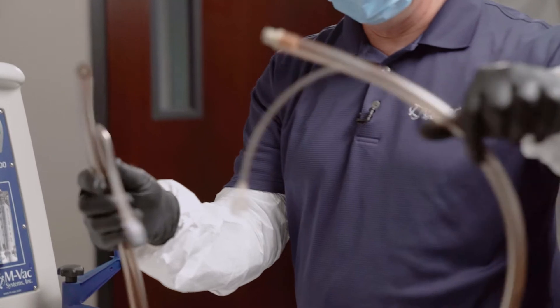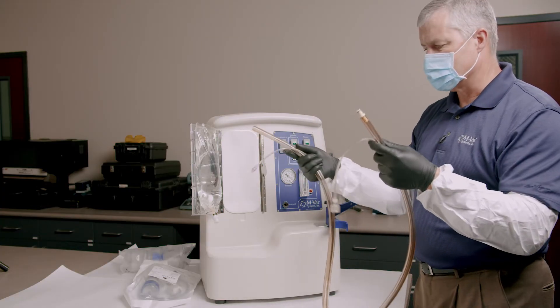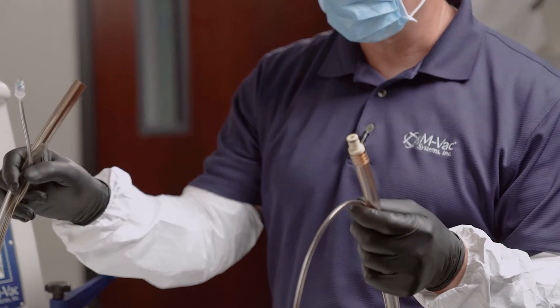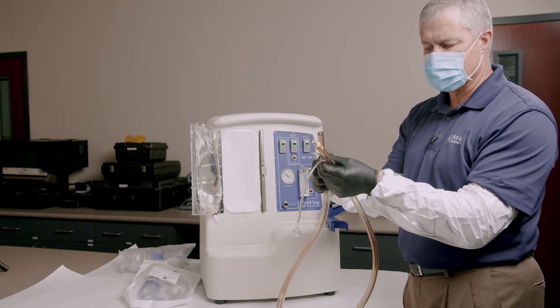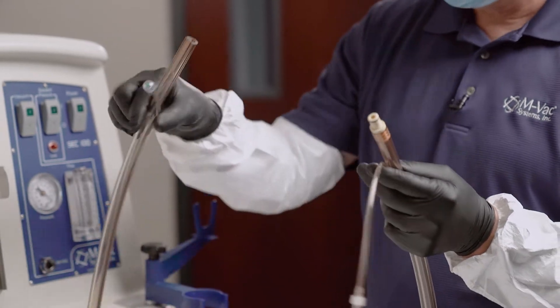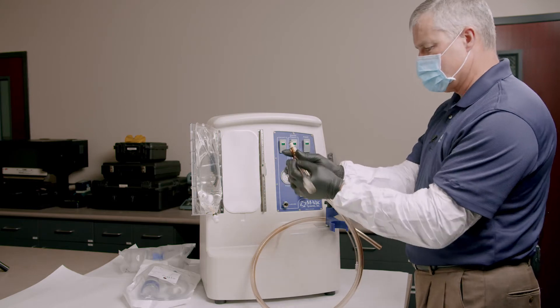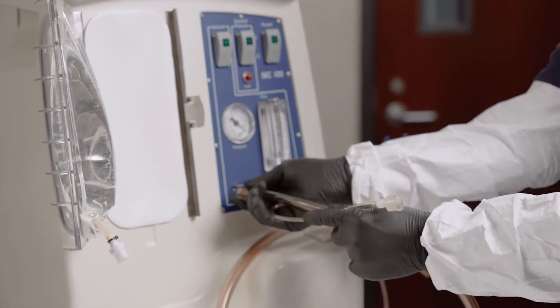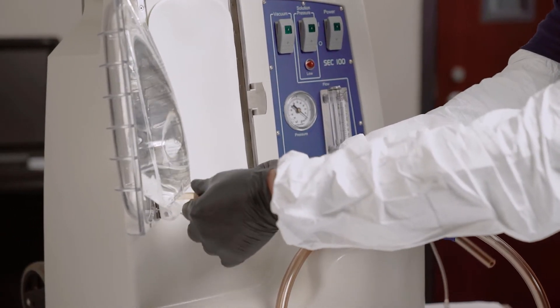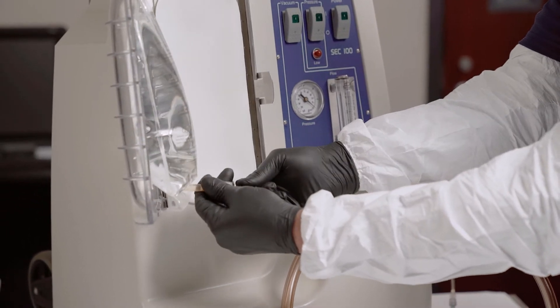This tubing has two different connectors. One of these connectors is going to go into the solution bag and the other one actually connects to the MVAC collection device. The smaller line is the solution line and the larger line is the vacuum line. This is a quick connect — it goes into the vacuum port there. I connect this and make sure that's all tight, then I can close this door.